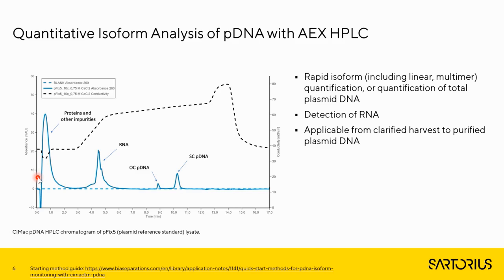And I would like to say it's now becoming quite a generic and generalized HPLC analytical method based around an anion exchange chromatographic column that gives us high resolution of plasmids, particularly supercoiled plasmid that's separated from open circular and linear forms, as well as actually being able to quantify residual RNA, which is a predominant impurity in the plasmid process. And it's one of our tenets in process development to use this as one chromatographic method to support purification chromatographic methods as we move throughout the process. So let's see how we use this to generate some useful data whilst producing plasmid DNA.